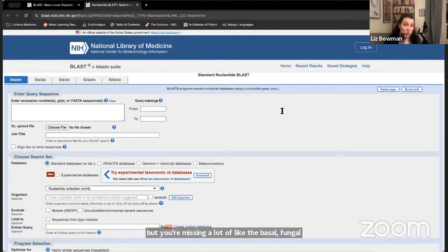This can be like chytrids, which are definitely present in soil. Previously Zygomycota, which has now been broken up. And even AM fungi, which are Glomeromycotina, a separate group from Ascomycota and Basidiomycota, can be less amplified, even though they are there. The primers that you use might not pick them up. So it is better to use multiple primers, 100%.